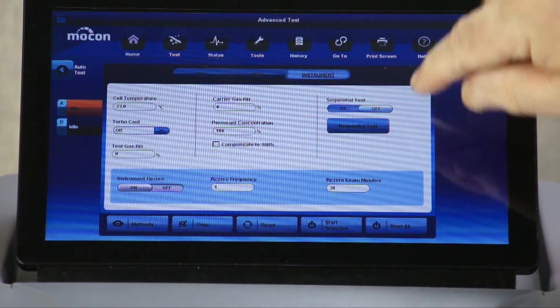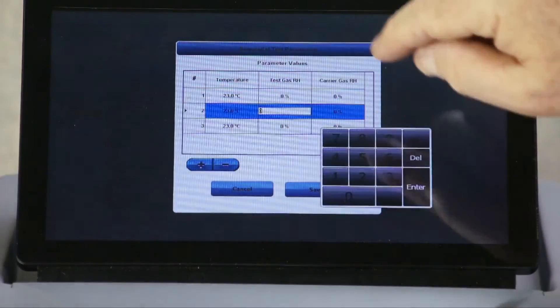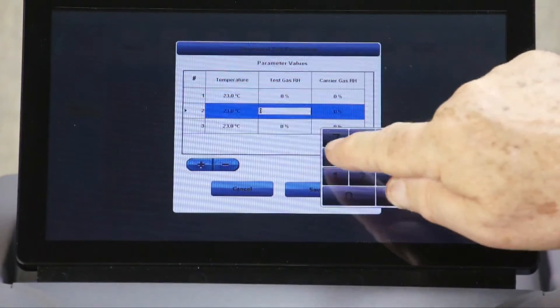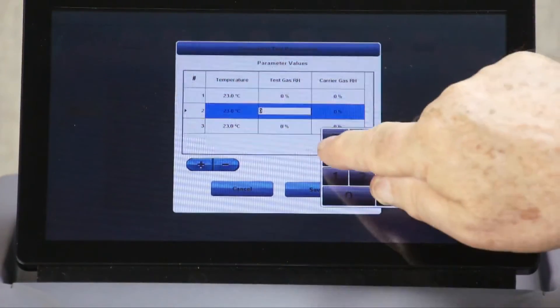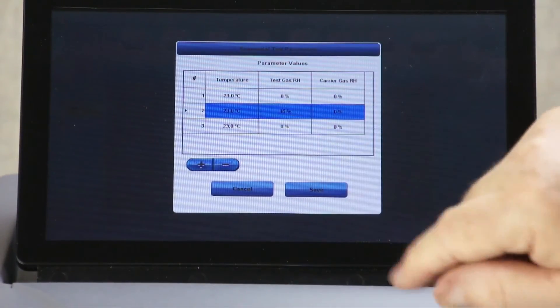Turn sequential test on, then select it. Now you can enter your test parameters and add additional sequential tests.